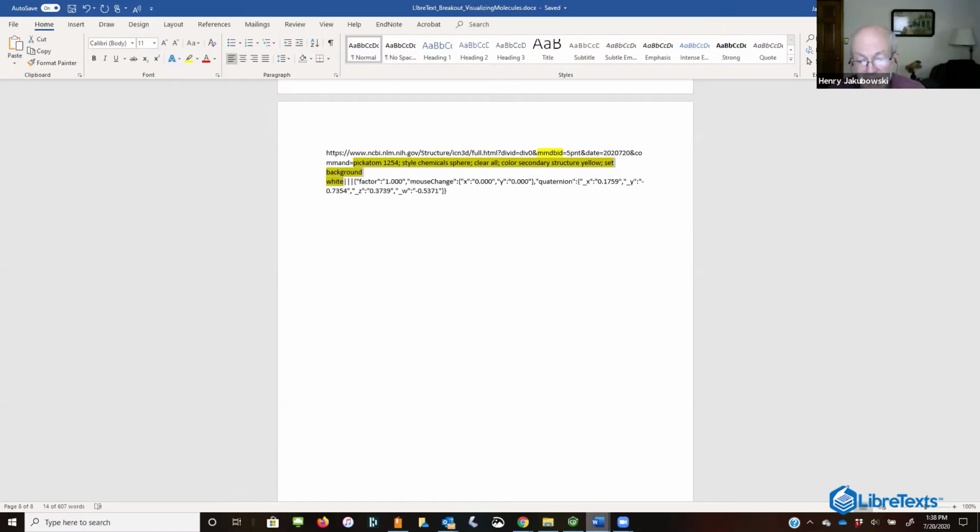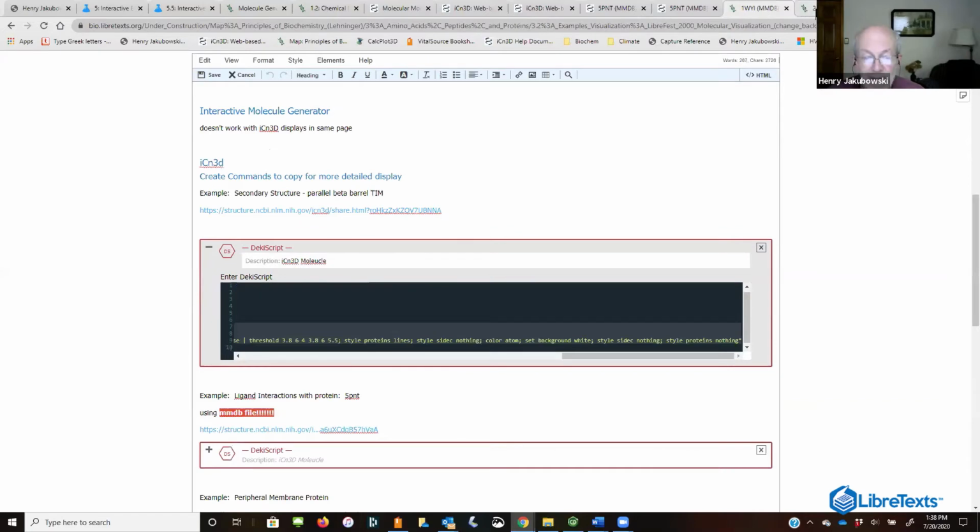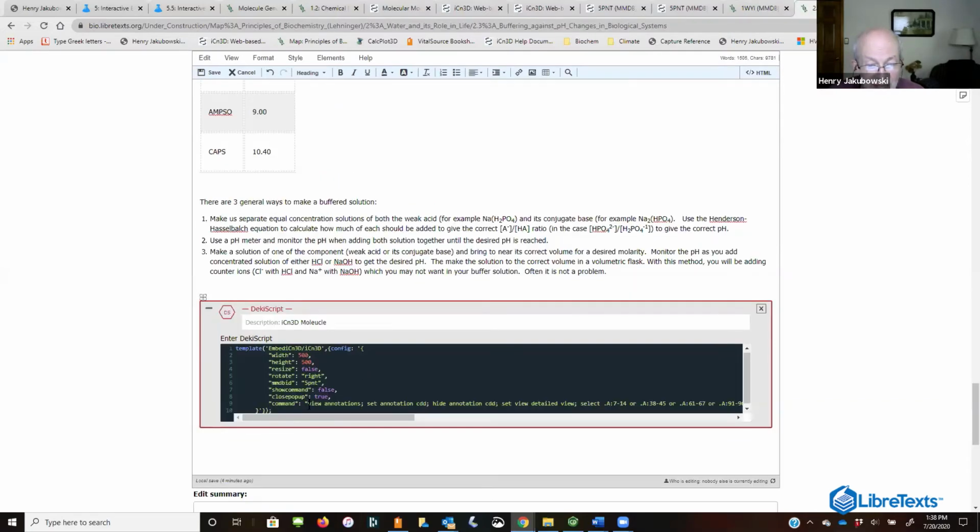And then I'm going to paste them into the template that I have. So it's reasonably simple. I've got to make sure I'm at the right place. Yeah, this is where I want to be. I want to get rid of these because I just copied those from the other one. In the document I made, I gave you what these templates look like. So it's just a matter of cutting and pasting yourself.